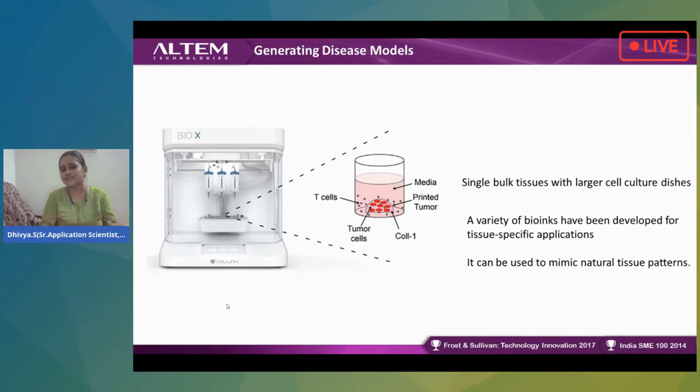And here comes personalized medicine also. Say a person has resistance to many drugs, and we have to treat that person to save his or her life. We can take a tissue from that person, culture it, print it with the bioprinters, and screen a maximum number of drugs to see which one the tissue is not resistant to. That will help you understand the behavior, and one can also treat with that medicine. So here comes the role of personalized medicine when we use this technology.